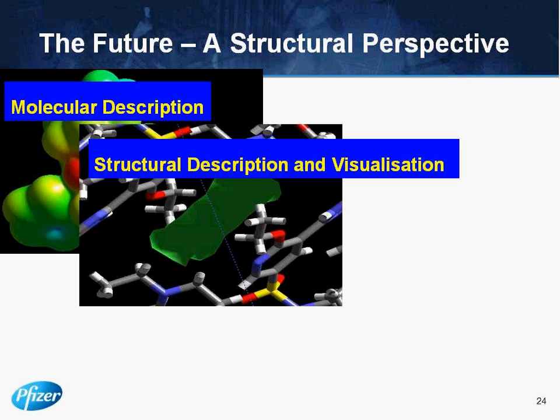I also like to be able to calculate properties and analytical signals. Here we've simulated a PXRD pattern to illustrate the point. So to be able to calculate both properties and simulate some key characteristics of the API. And ultimately moving up to that particle and surface understanding. So being able to describe the different chemistries that exist on the different faces of your API and how that will interact with your crystallization solvent, with your impurities, and with your excipients as you design your product.